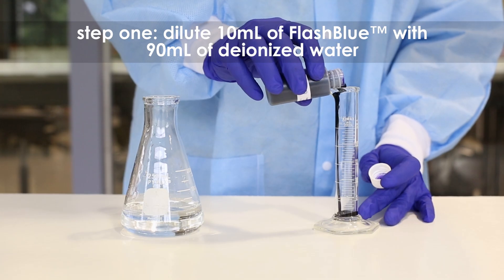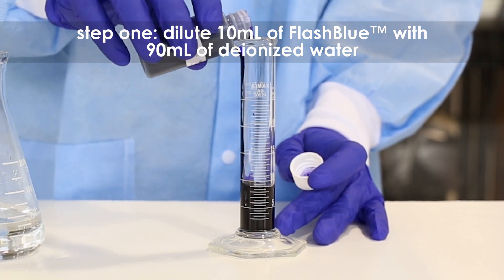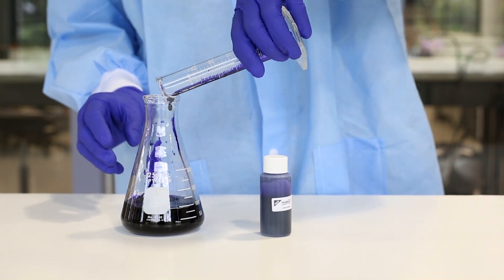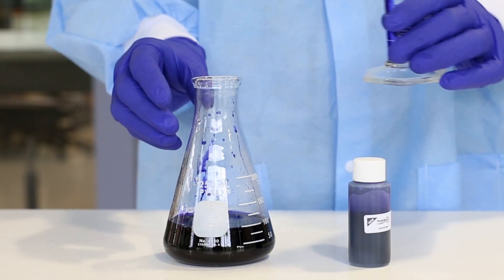Step 1. Dilute the stain by combining 10 ml of the concentrated Flash Blue with 90 ml of distilled or deionized water in a flask. Mix well.